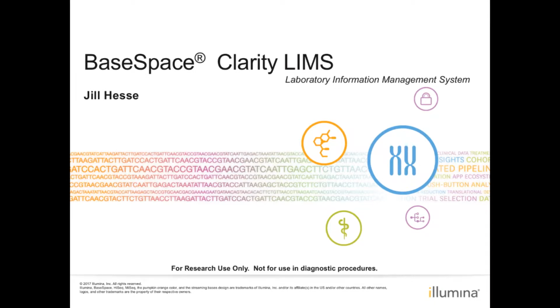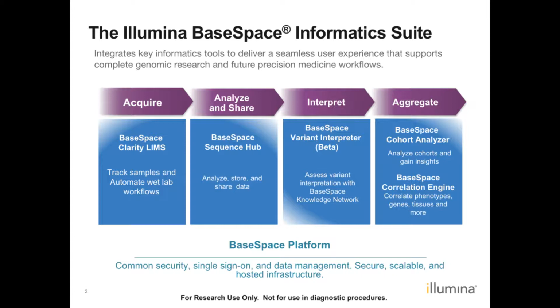Welcome to this introduction of BaseSpace Clarity LIMS. As you may know, Illumina has a suite of informatics products designed to help you integrate key informatics tools and allow you to go end-to-end from sample to analysis. BaseSpace Clarity LIMS sits right at the front of the informatics suite, where we track samples, automate the wet lab, as well as keep track of many other components necessary for your day-to-day lab usage.